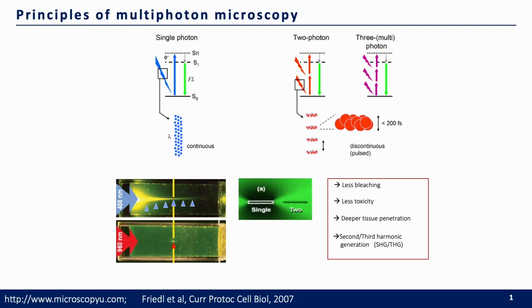Two-photon or multiphoton microscopy has emerged as a powerful tool for intravital studies in many fields. The advantages include 2 to 3-fold improved penetrance in thick tissues, compared, for example, to the confocal, up to approximately 1 millimeter of image depth, but also the ability to record the behavior of living cells over time and the possibility of monitoring the changes of the tissue structure and the molecular processes.